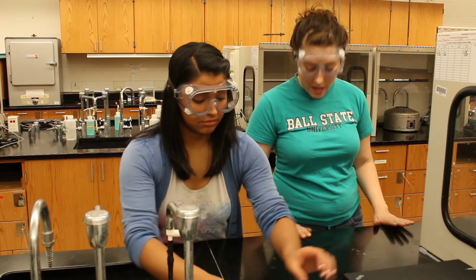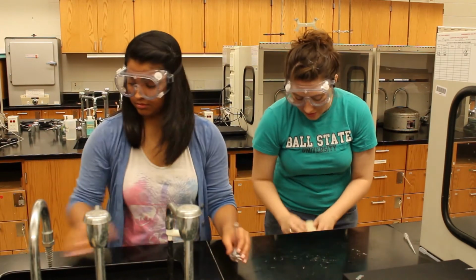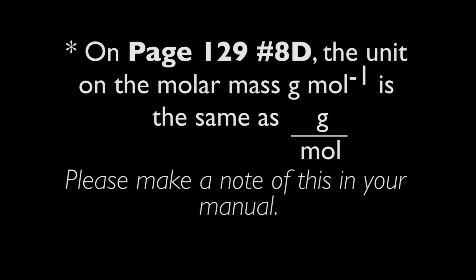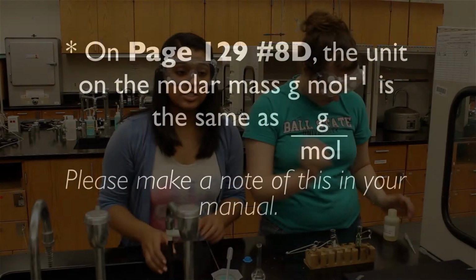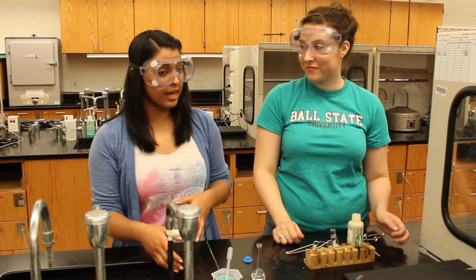In the next part of the lab, we'll be using nickel sulfate to create different complex ions. When salts containing transition metals dissolve into water, they make cations that form covalent bonds with molecules like water and ions like chloride. These then result in complex ions.